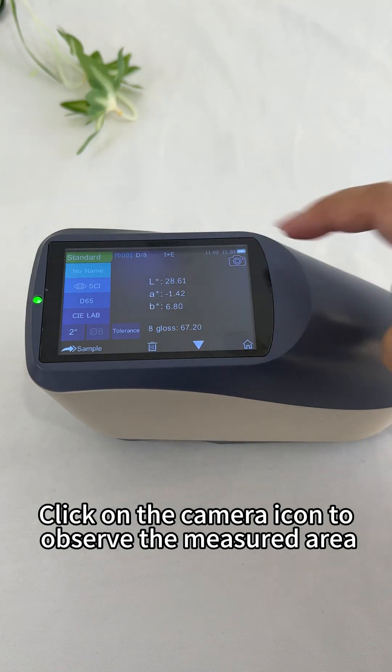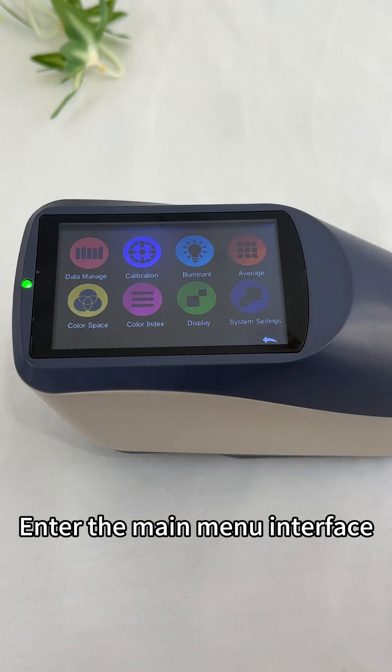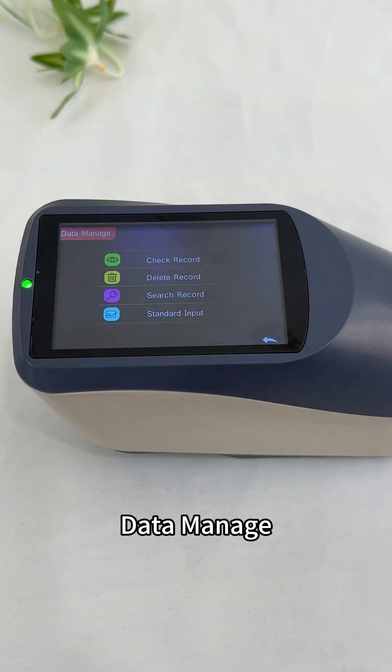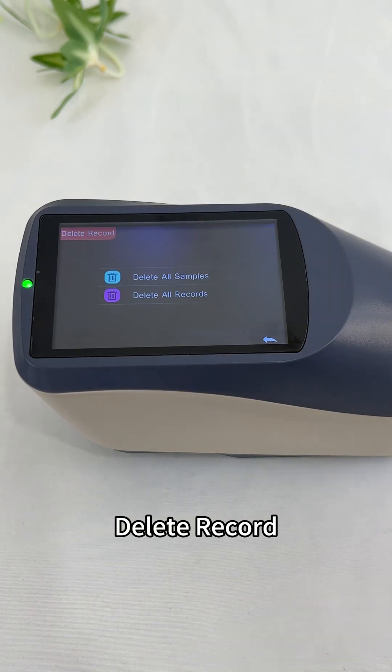Click on the camera icon to observe the measured area. Enter the main menu interface and go to Data Manage, then Check Record. The record name can be modified, and records can also be deleted.